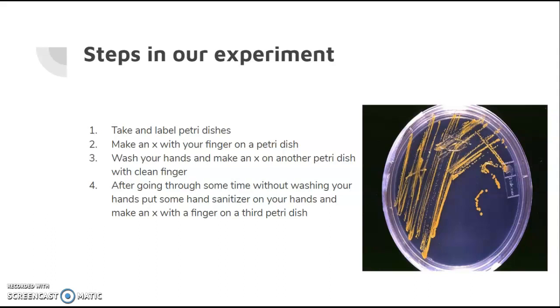Then the next petri dish, what I did is I washed my hands, and I made an X on the petri dish with my clean finger after washing my hands. Okay? And I wrote on that washing hands. And my third petri dish, I wrote hand sanitizer. Okay, so I had to wait some time, and my hands got a little dirty because I couldn't do it right after washing my hands, because otherwise it might have been washing my hands and using hand sanitizer at the same time. Okay, I'll just add that in today.